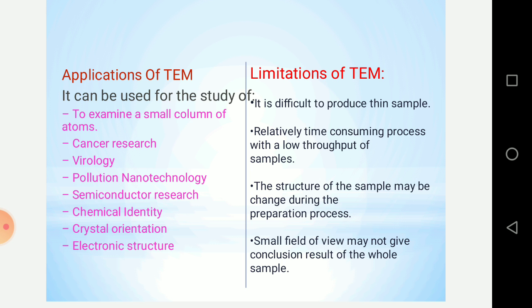Next, a small field of view may not give a conclusive result for the whole specimen. With this transmission electron microscope, we can focus on a very small area. So by focusing on a very small area, we will not get an idea about the whole specimen.